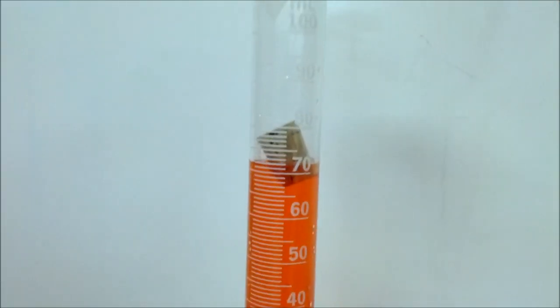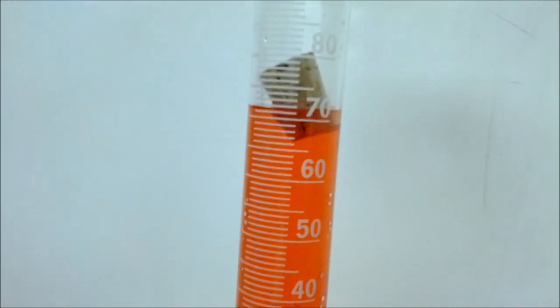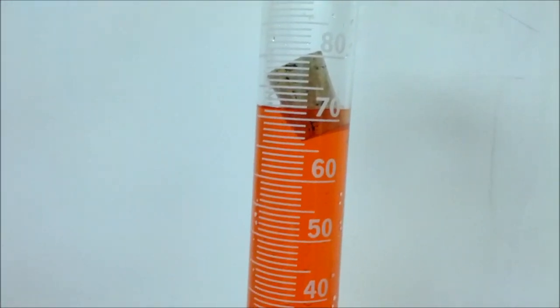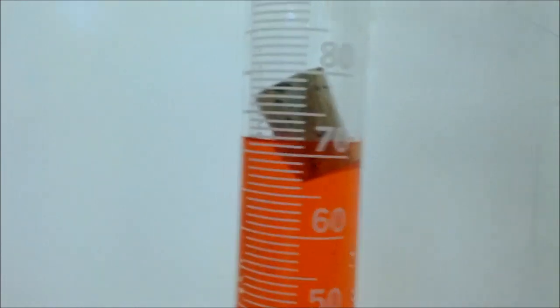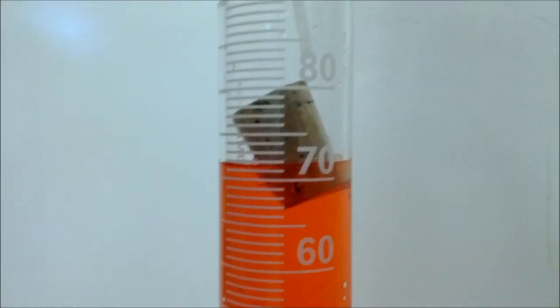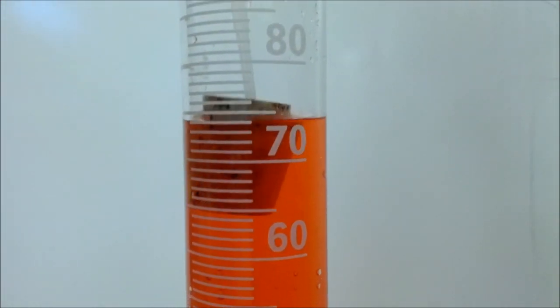All right, see how the cork is floating? And that's not going to give us an accurate measurement of the volume. So what we have to do is push it down totally in the water with something. Ms. Kloss is going to use the pipette that we were using to fill it up with.